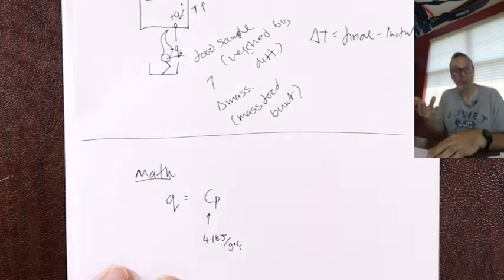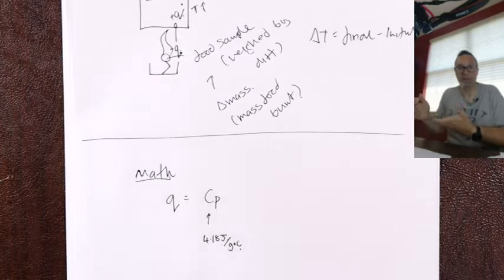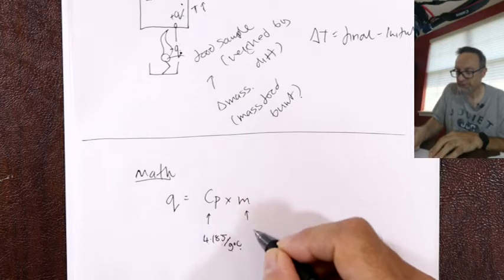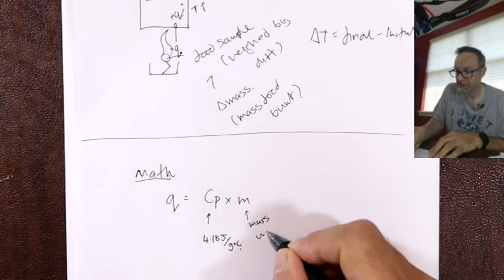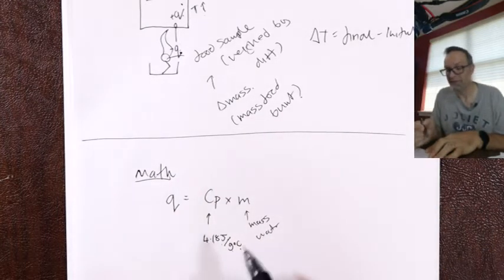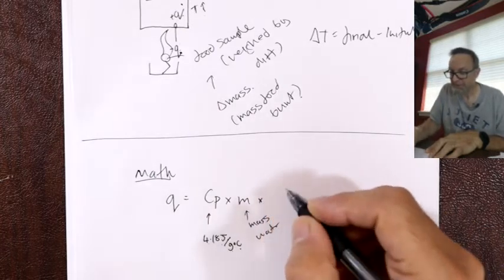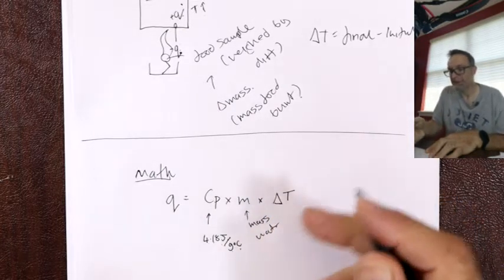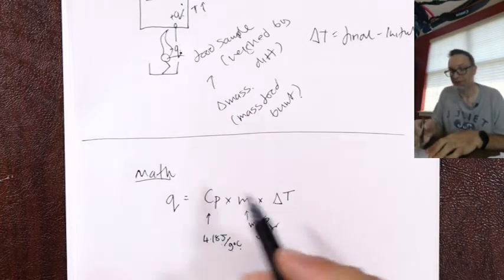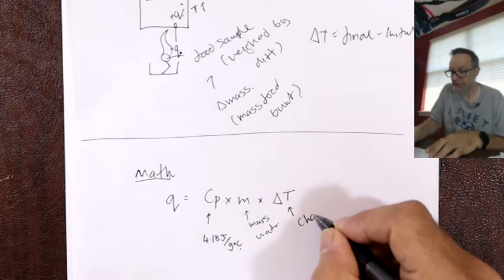Now obviously the more water you have, it's not going to get as hot, right? So like a big full pan of water takes more energy to boil than half a pan. So that's where the mass of the water comes in. So that's mass of water in the can. That's going to be around 50 grams if you use 50 milliliters. I can't remember the exact volume they used in the video, but in lab we use 50 grams of water, all the sig figs, don't forget. And then the change in temperature. When we do the packet later with thermochemistry, we'll see this again. So this is kind of coming a bit early in terms of the syllabus, but it's not so challenging. Change in temperature, delta means change.